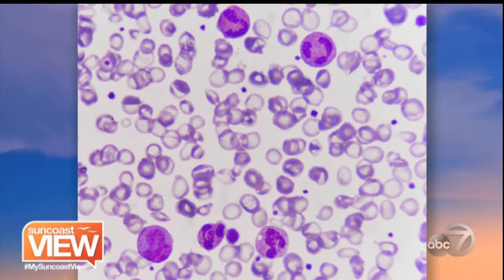So this is an actual patient of mine. If you're looking at this slide right here, this is a patient that presents anemia. This person has a lot of autoimmune issues, but you see how the normal cells look round and full and red. You see how a lot of those little ones right there, they're clear, and you can just see the ring, and a lot of them look hollow, like they have little holes in them. So that's a sign of somebody that's anemic.